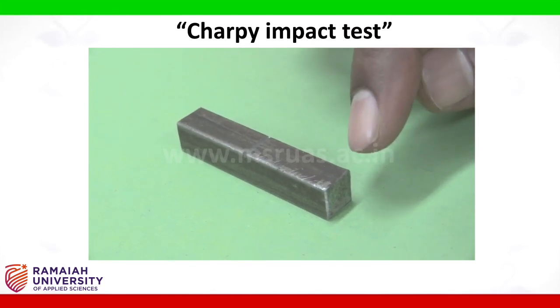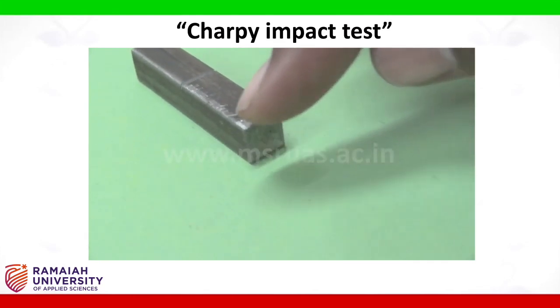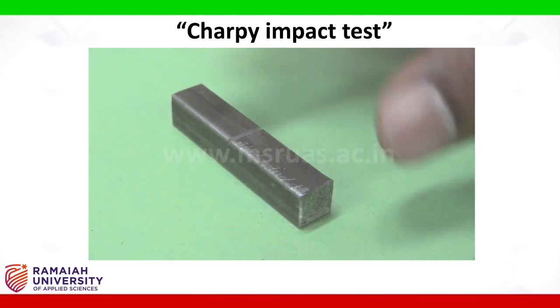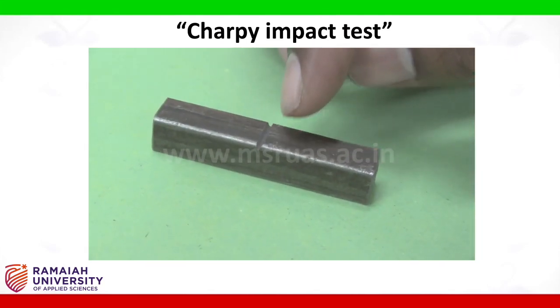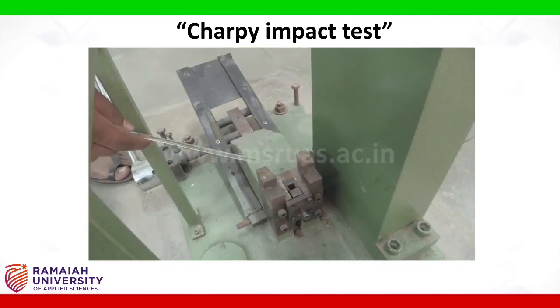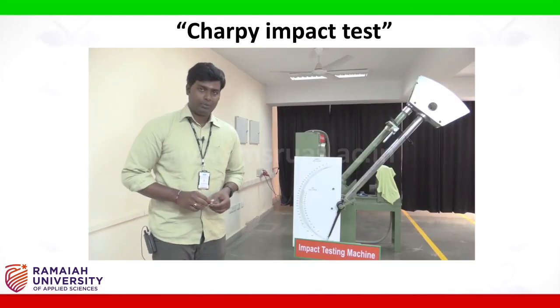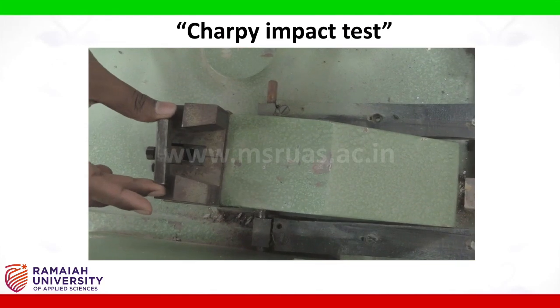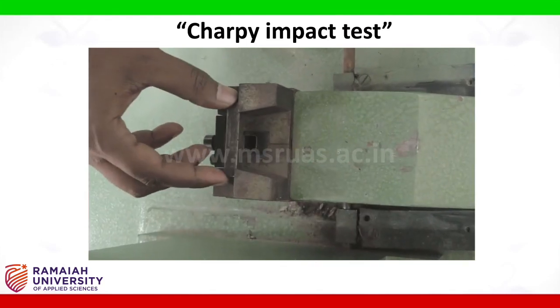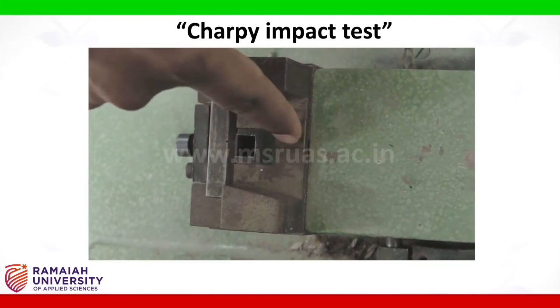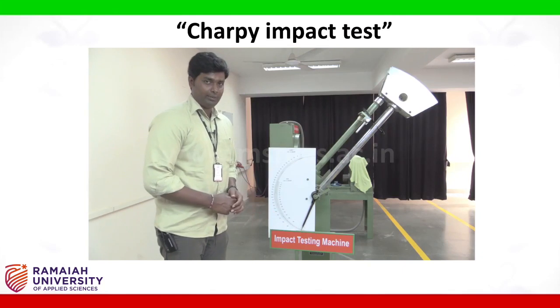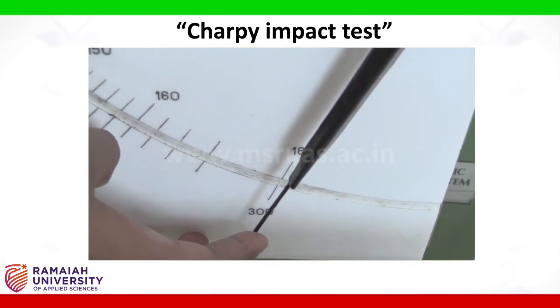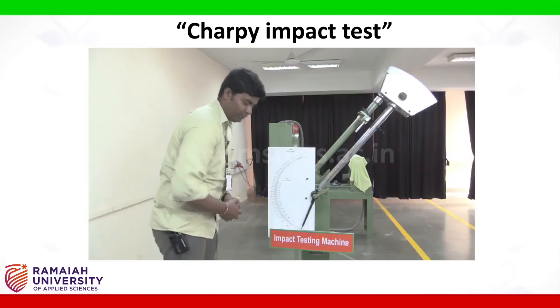To start the Charpy test on mild steel, take a mild steel specimen of cross-section 10 mm by 10 mm and length 55 mm, with a V-notch of depth 2 mm. Place the specimen over the specimen support such that the notch coincides with the reference line. Then keep the pointer at 300 joules and take 300 joules as the initial reading.